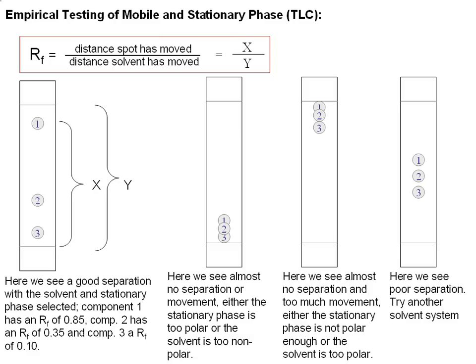So your lab is going to involve a reaction, separation, and thin layer chromatography. Good luck.